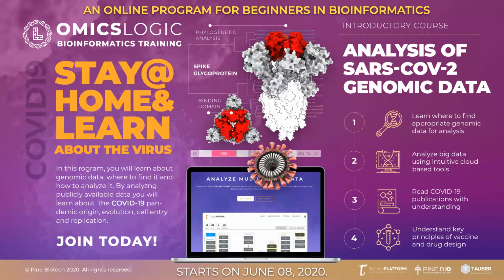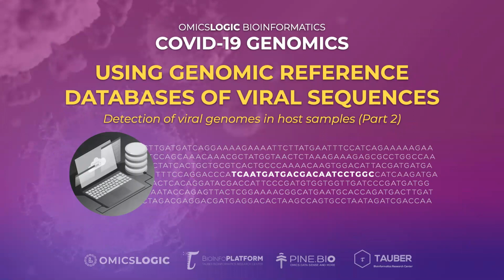So today we're going to be talking about using genomic reference databases and references in general. We're going to dig a little bit deeper into the mapping of those reads on the reference genome, understanding what a single genome can reveal, what multiple genomes can reveal, and we'll build it up towards the understanding of sequence alignment and quality of alignment. Later on, we'll apply this understanding to the ability to compare different sequences of genomes that are available in the public domain.